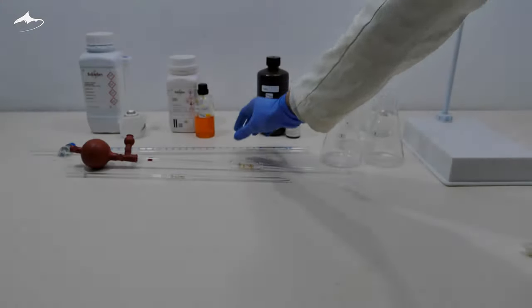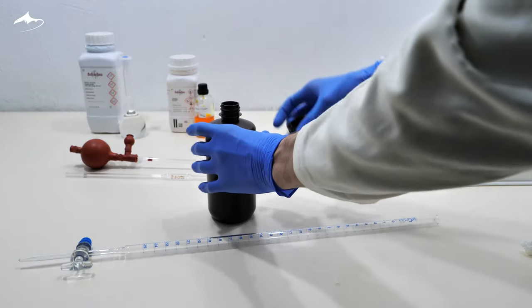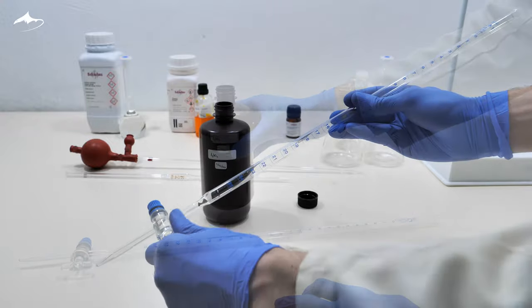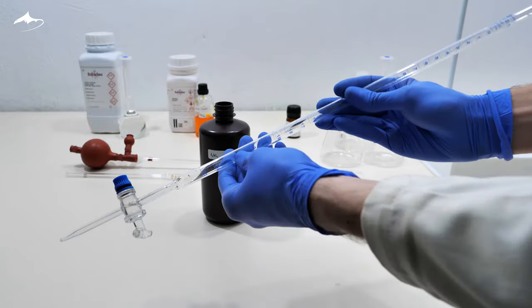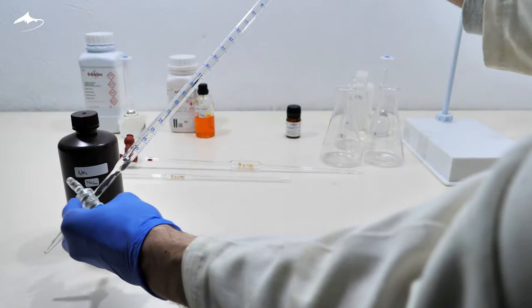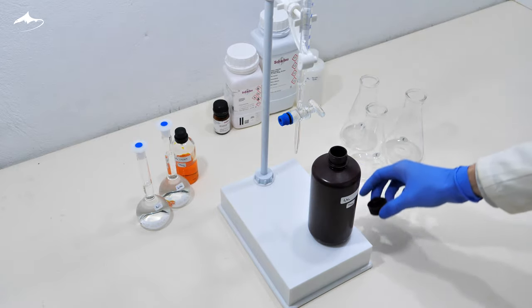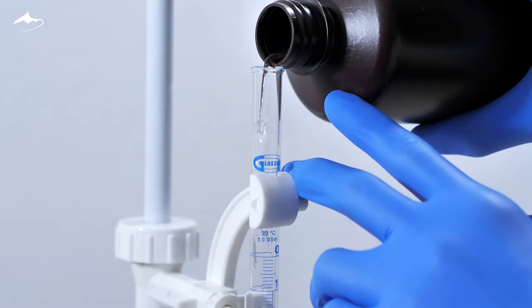First up, the standardization of the silver nitrate solution against sodium chloride solution. For that, a small volume of titrant solution is used to wash the burette. Once done, the setup is arranged and the burette is filled and primed with titrant solution.